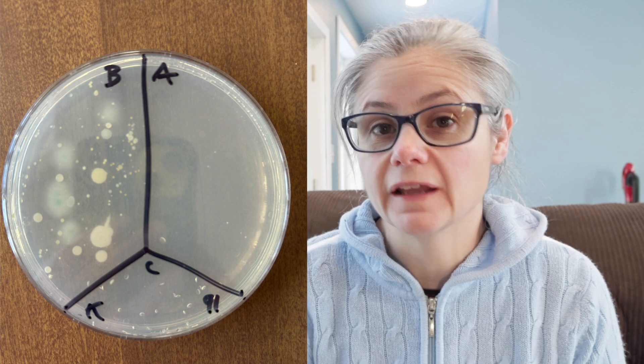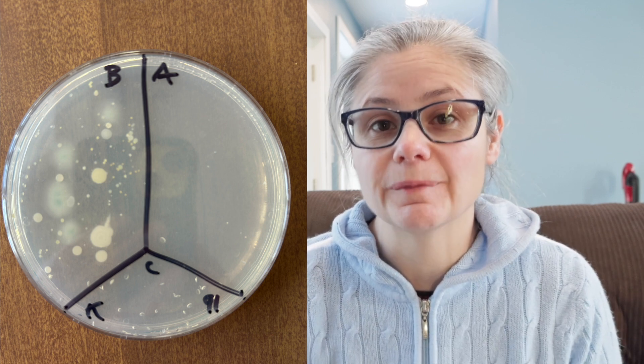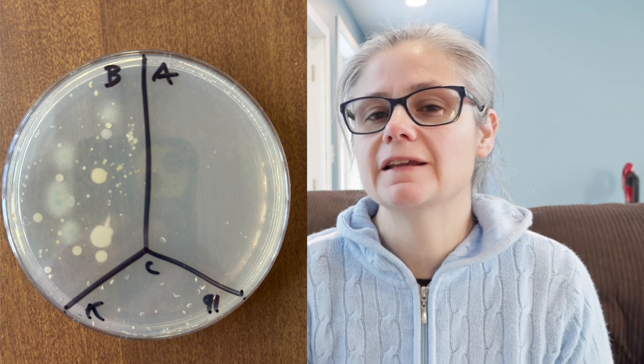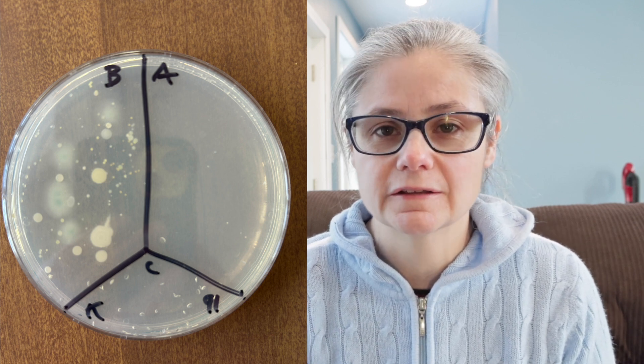Now let's look at the results. In the before section, we can see some bacteria and probably some mold growing there. There's a bunch of different types of growth on this plate — it's actually a really cool sampling of bacteria and probably mold from my floor. In the after section, there are maybe six or so tiny, tiny bacterial colonies. So the Bona did a pretty good job of removing the bacteria from my kitchen floor.